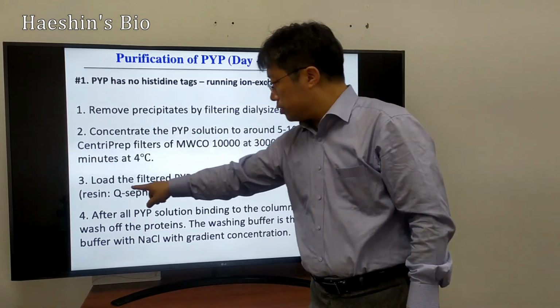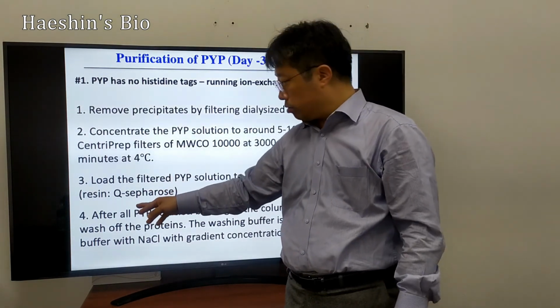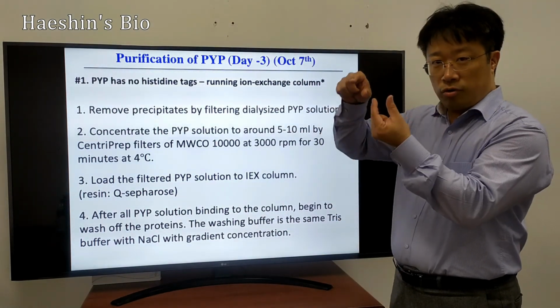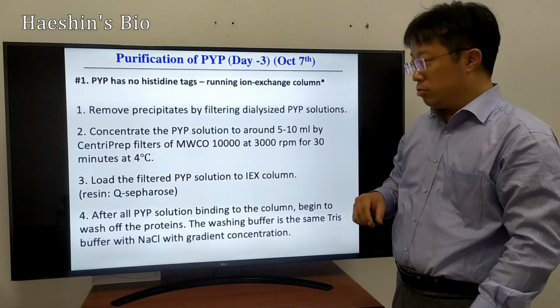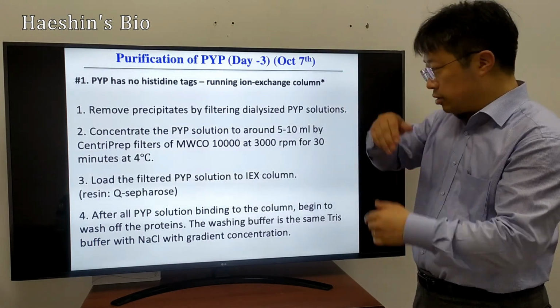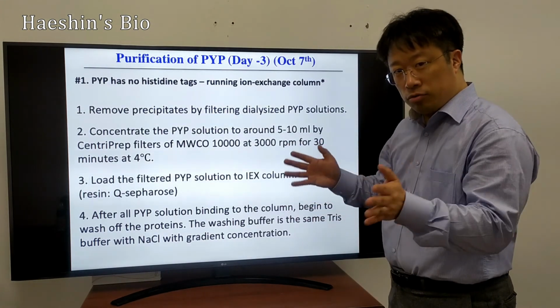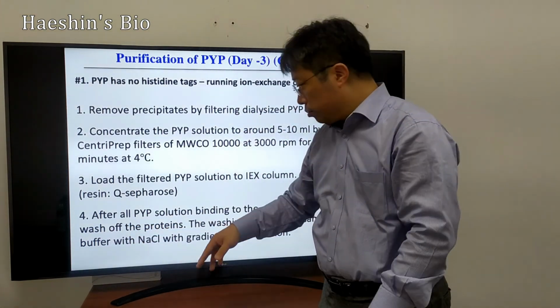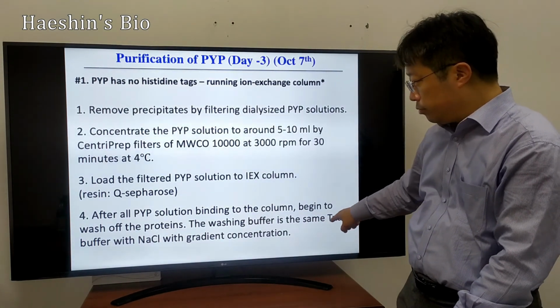And then that volume is loaded onto an ion exchange column. It's the resin we particularly use, Sepharose resin. So imagine that you have a column that I showed you before in the previous class, and then you load the protein solution, and the proteins will be adsorbed on top of the resin. The proteins will be bound to the column overall, and then you wash a little bit, washing off weakly bound protein with the washing buffer, the same Tris buffer with sodium chloride.